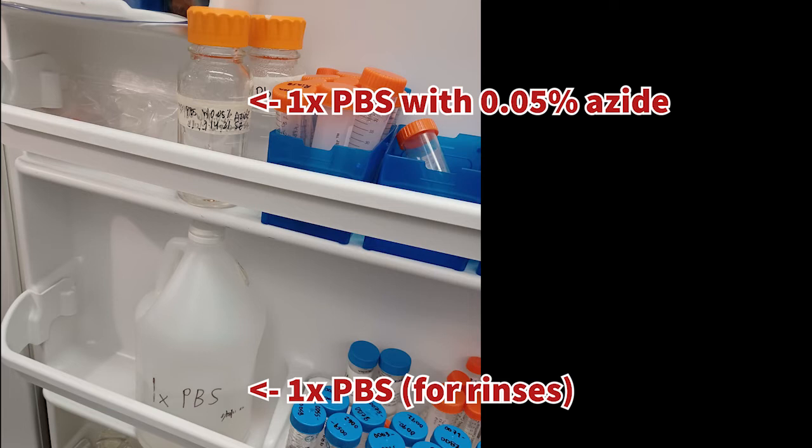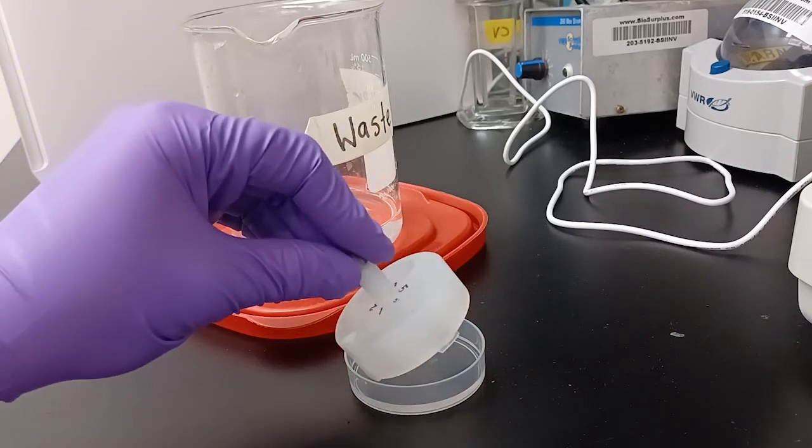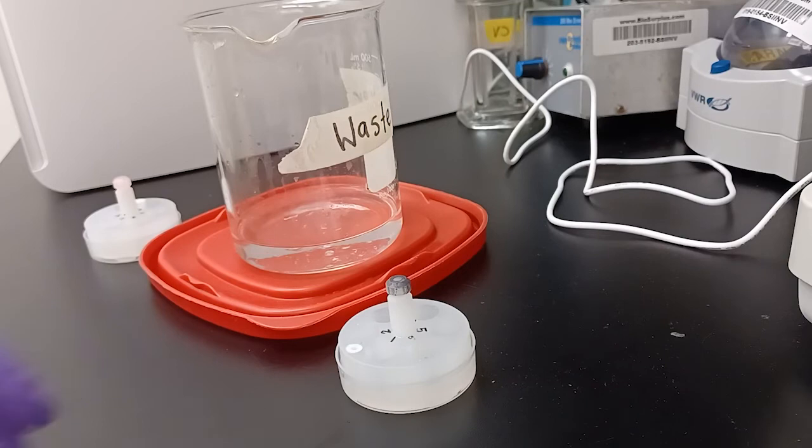As a reminder, the bottle's location is in the top shelf of the fridge door if you didn't take it out earlier. Pour this PBS with azide solution directly from the bottle into each of the three basins. Reinsert all the netwell inserts.